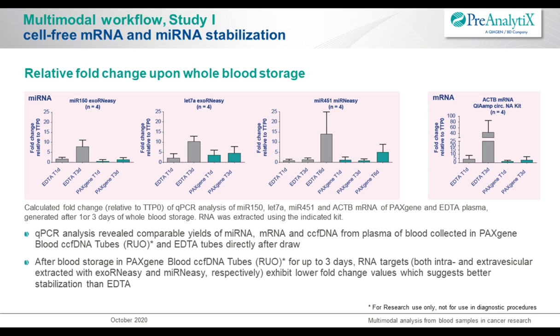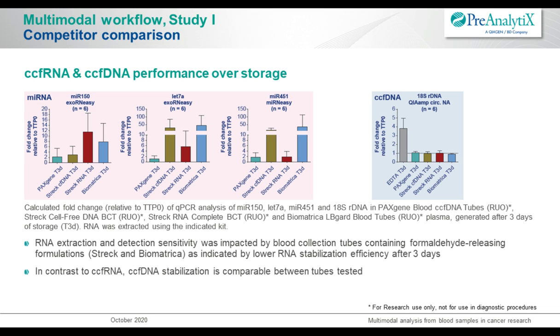And on the right, you see also an example for mRNA isolation, with mRNAs nearly exclusively found in exosomes, and you also see that the stabilization with the PAXgene tube is very good in contrast to the EDTA. So overall, we can see from this that we get some kind of stabilization for up to 3 days. So we decided to work further with 3-day stabilization. And that is shown on the next slide as well.